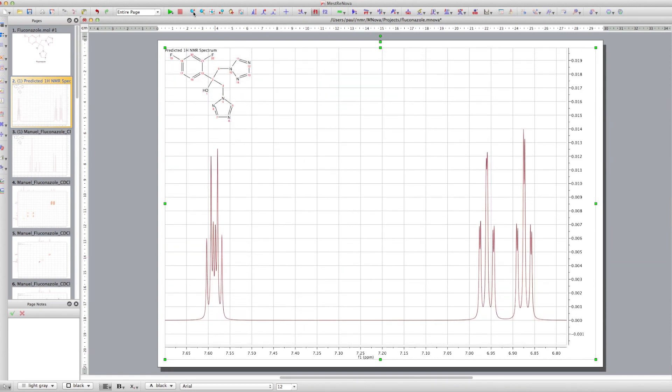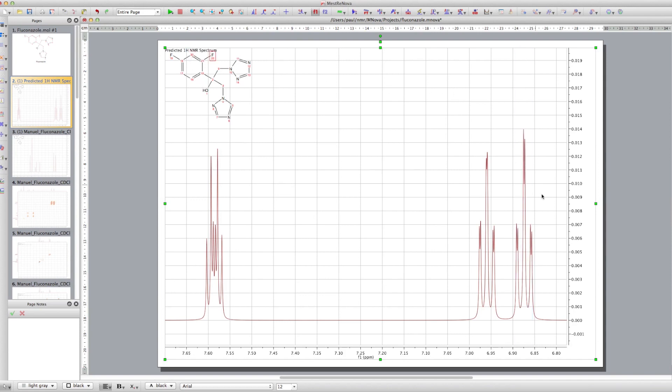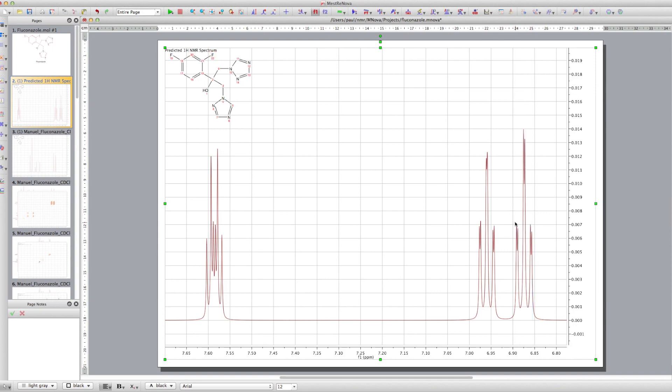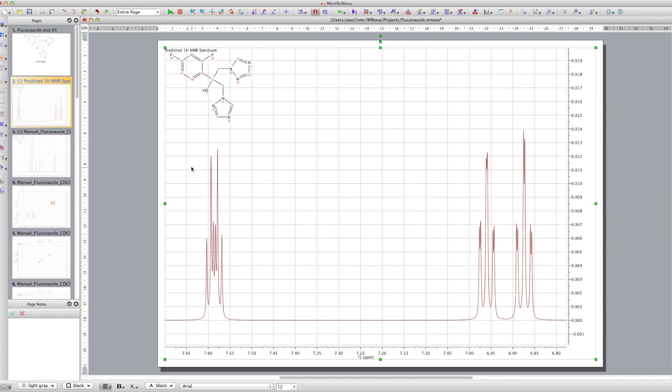This is really interesting, especially if you've never seen a proton spectrum which you've got fluorine in. So we've got a triplet of doublets if you look at that in close detail for the coupling to these two fluorines here. And this proton here is a doublet of triplets.